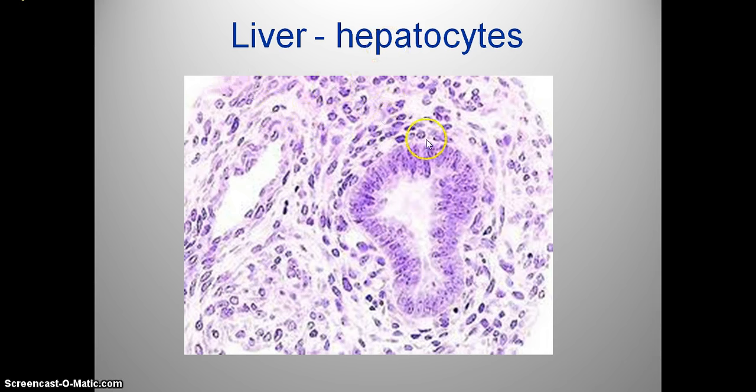And very interestingly, again, notice the column-like shape of the cells, large nucleus. Why do you think the cells have such a large nucleus? Obviously, they produce substances which are then secreted into the duct of the bile duct. This is called bile duct, and it leads eventually into the small intestine. And we have all other cells right here.